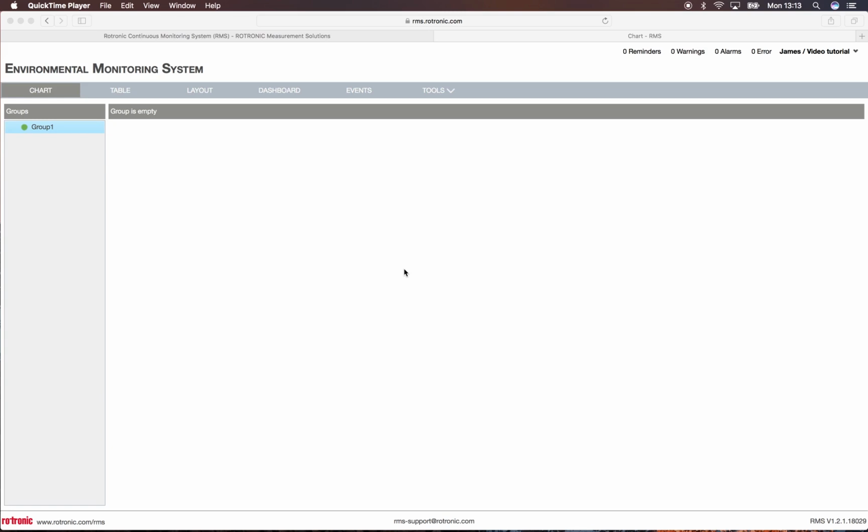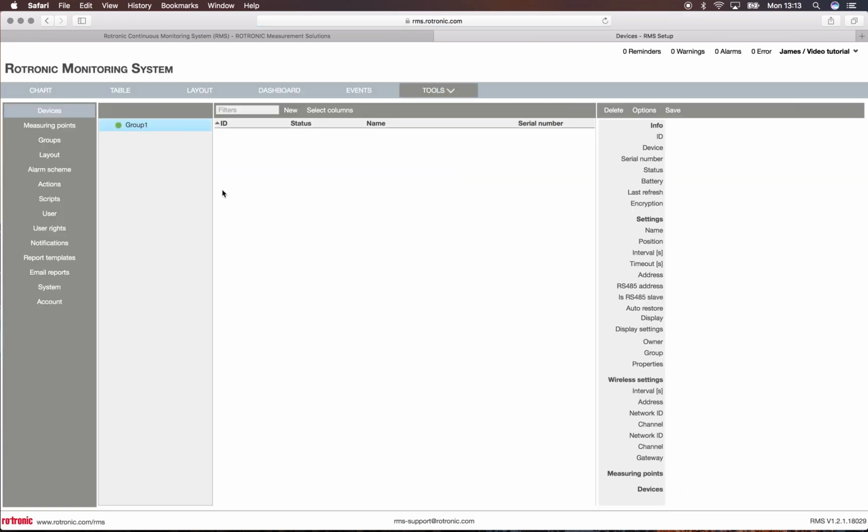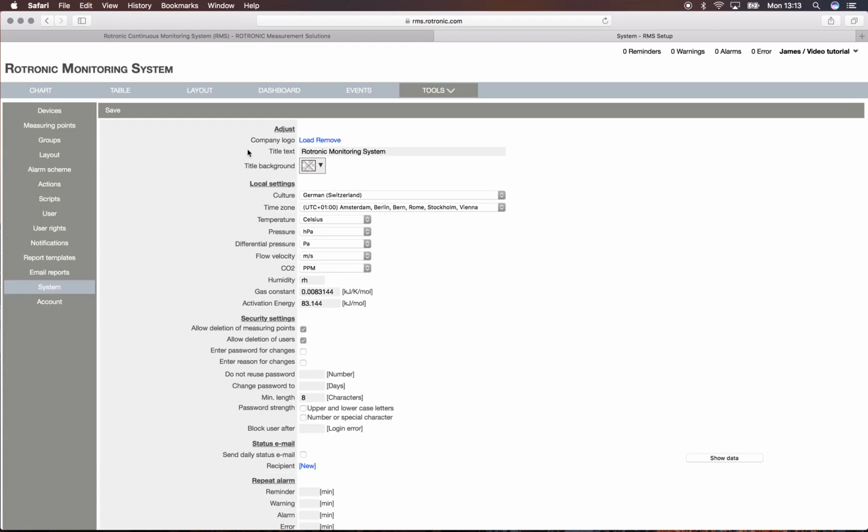Welcome. In this short video we'll see how to add a logo and update the name of the monitoring system. Under Tools, click on Setup, and under Setup on System. Here you have the possibility to adjust the company logo and update the name.